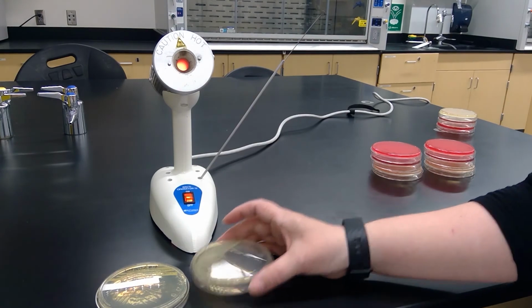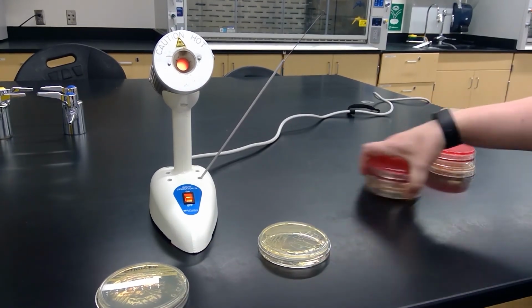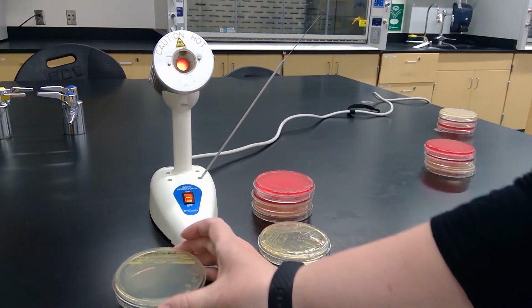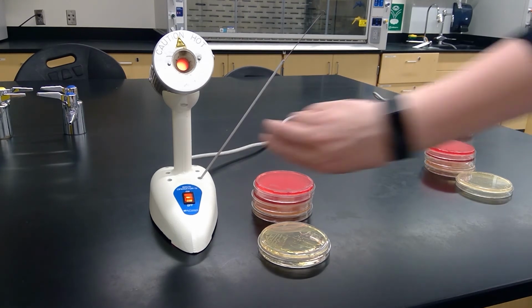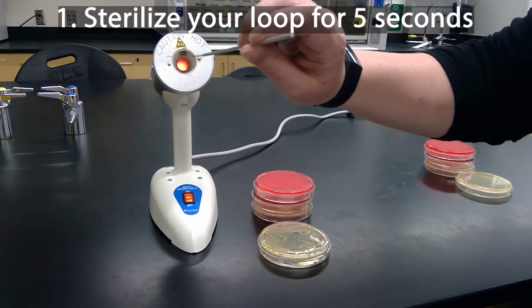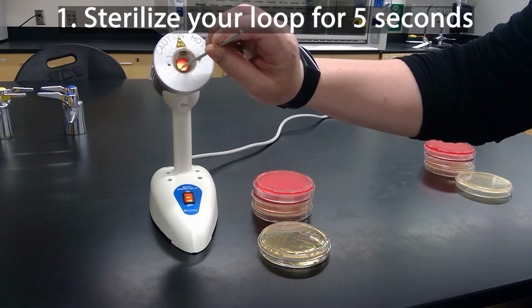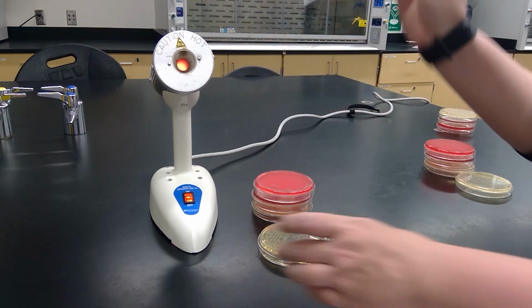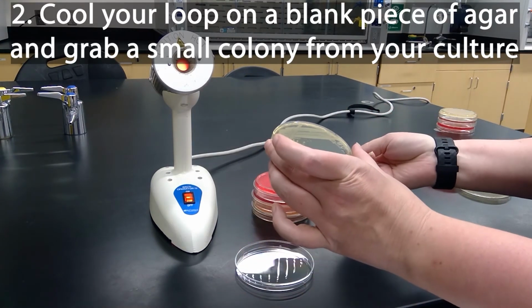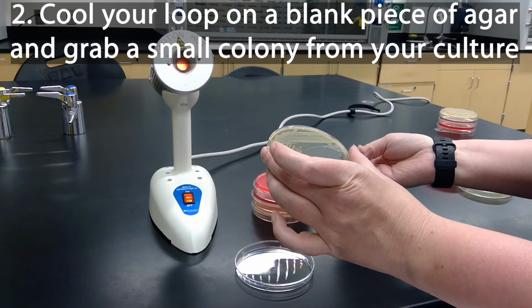So now we will do E. coli. And then I'm going to put unknown 9 by these. So we'll be ready. So now I'll sterilize my loop again. And then I'll grab some culture.